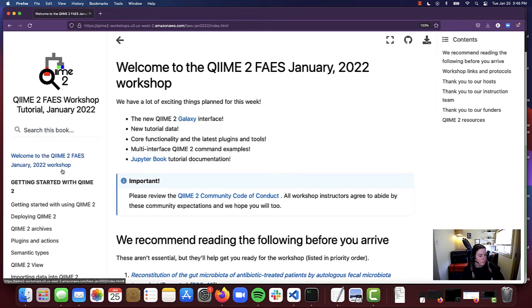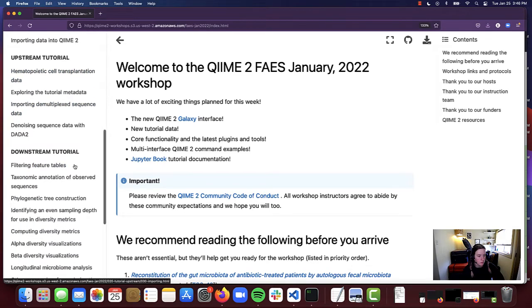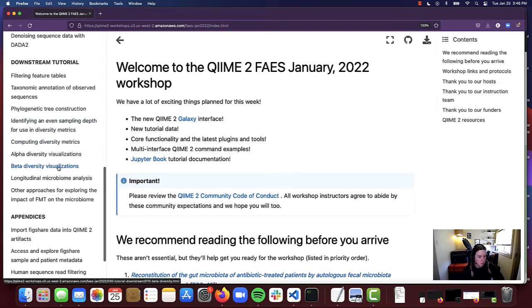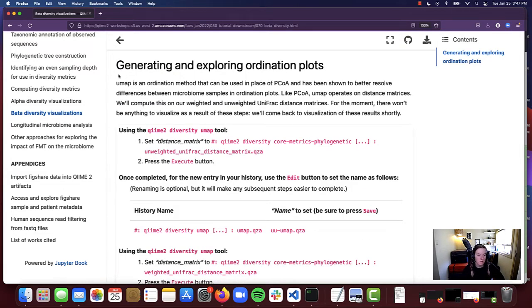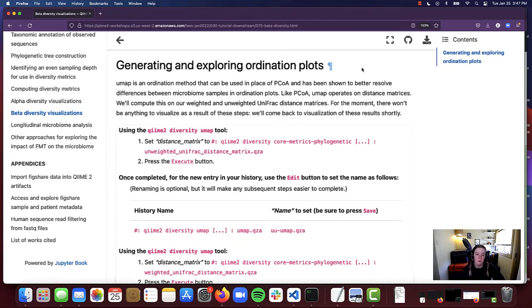Alright, so let's jump right in. I'm going to start by pulling up the tutorial and scrolling down to the downstream tutorial segment and selecting beta diversity visualizations, making sure our interface selector is set to Q2 Galaxy. We are going to start off by generating and exploring some ordination plots, beginning with UMAP — a type of ordination method that can be used in place of a PCoA or principal coordinate analysis plot, and has actually been shown to better resolve differences between microbiome samples in ordination plots.